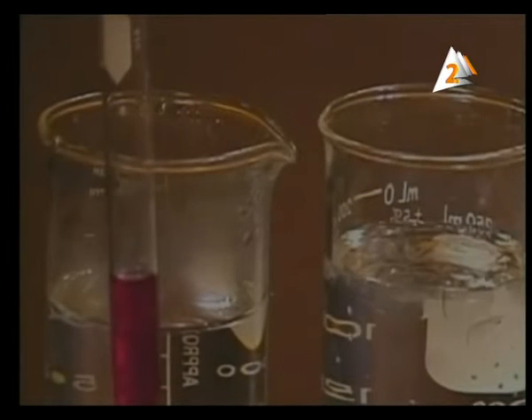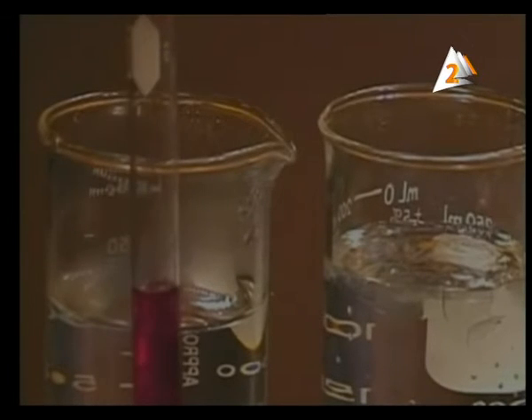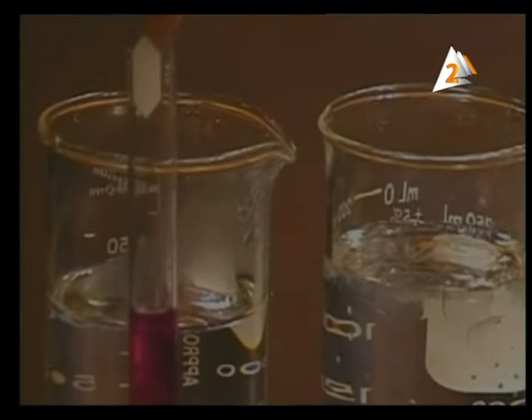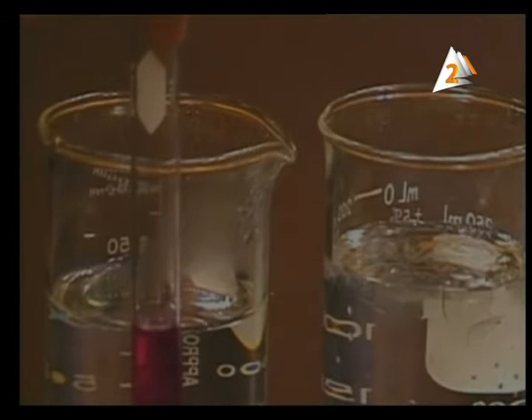My lovely, when you get two beakers, one of them has hot water and the other cold water, now I try to add the tube of the hydrated cobalt to both of them. For the first one, it's normal water. What happened? The color of the hydrated cobalt will be red or pink as it is. Good, but this is not all.